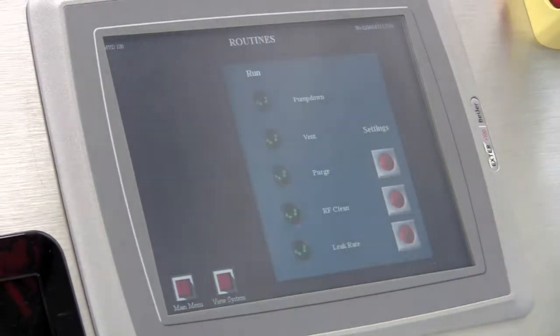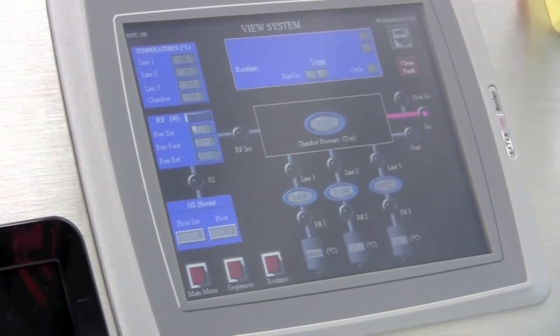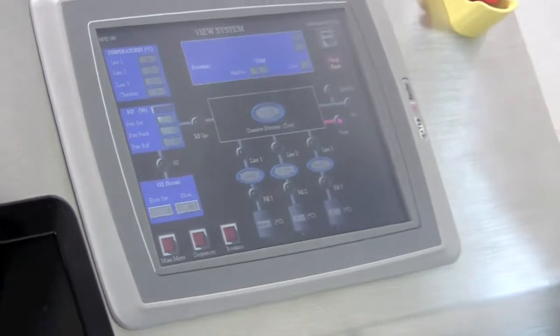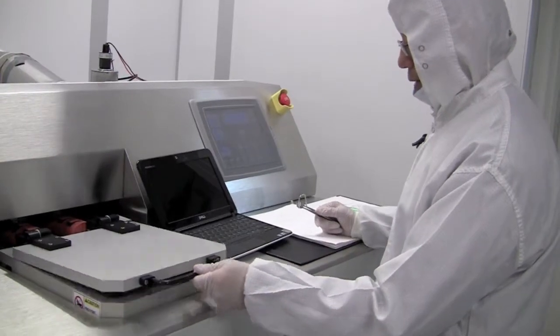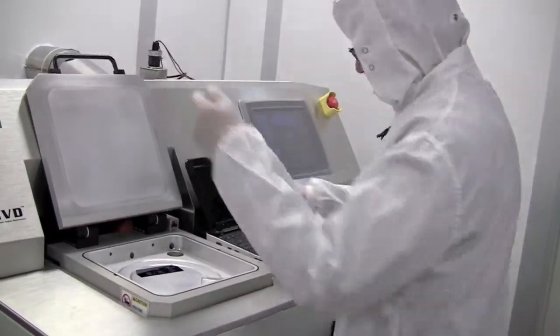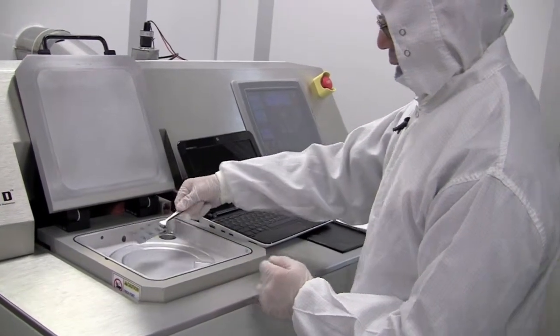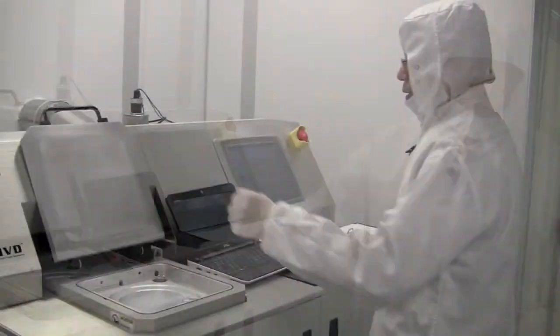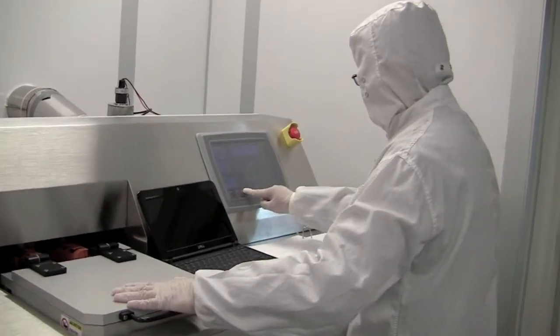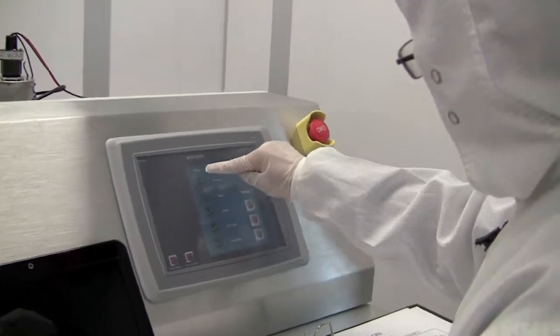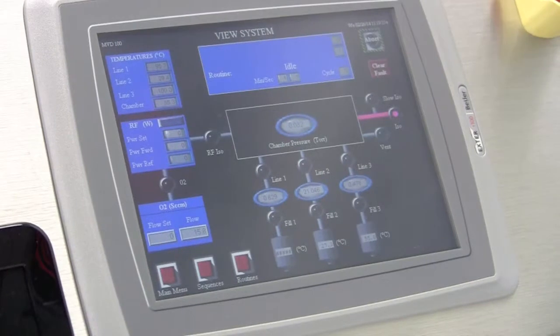We push routines again and vent the chamber. And the nitrogen comes in. We will hear the hissing sound again. Okay, we hear the hissing sound. And put the sample into the container. We close the lid and touch routines and pump down the chamber. Now the chamber is pumped down.